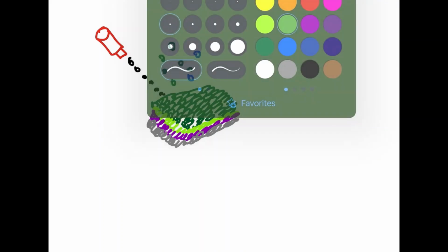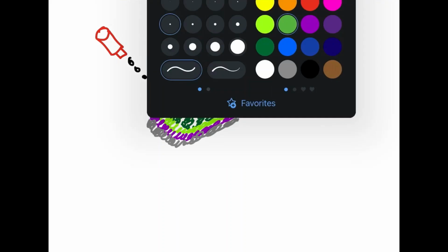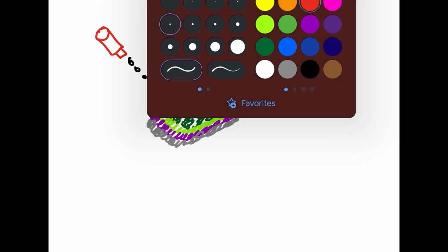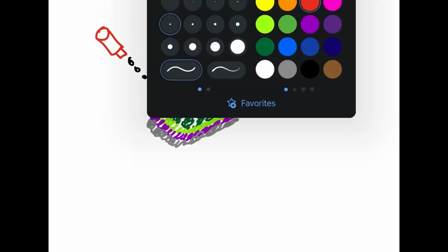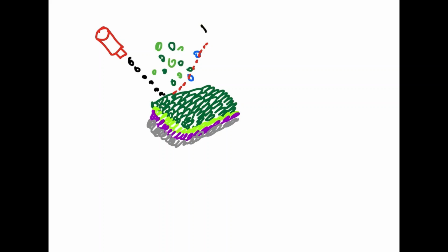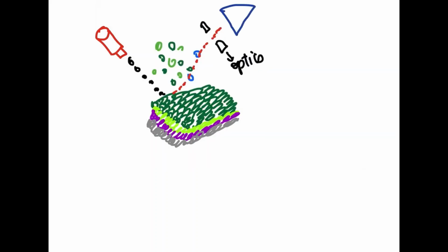Depending on the desired species to be analyzed, a variety of primary ion beams may be used, such as cesium positive, oxygen, argon positive, and gallium positive. Electropositive primary beams like cesium positive are used to ionize electronegative elements, for example oxygen, carbon, nitrogen, halogens, and chalcogens, and oxygen atoms are used to ionize electropositive elements, for example lithium, magnesium, etc. Liquid metal ion beams like gallium and gold are used for high-resolution studies, where the beam can be focused to a smaller diameter of less than 50 nanometer.